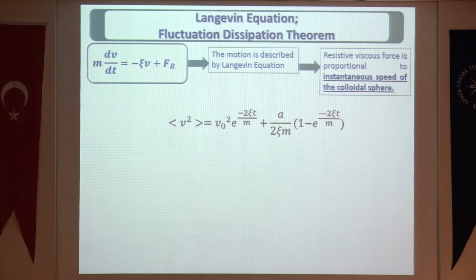In this technique, v is the velocity, and if you convert to the position, what we measure is the position at a certain frame.